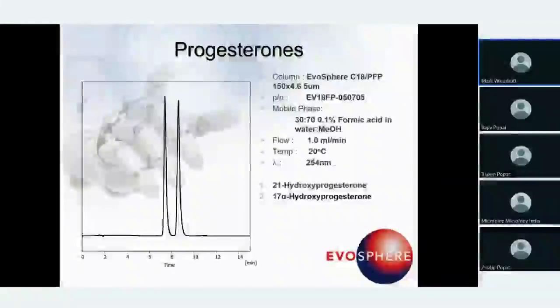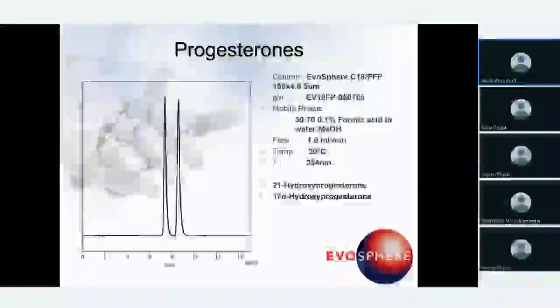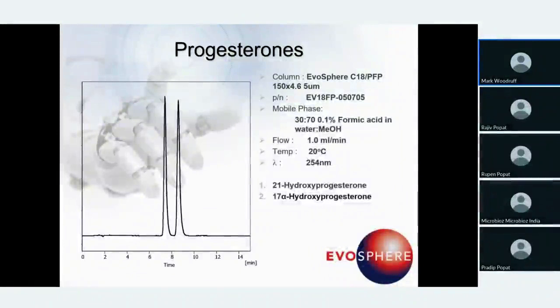Mass spec is obviously more sensitive and more attuned to seeing those peaks and knowing exactly which peak is which. But the one thing with mass spec where it often falls down is when you have things like isomeric species and you have the same molecular weights between compounds, and that's why you still need the chromatography resolution before you use mass spec as a detector.